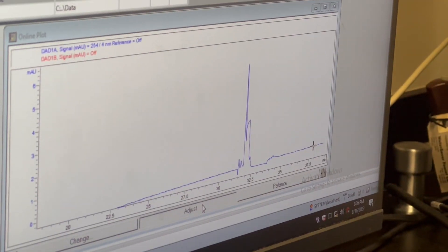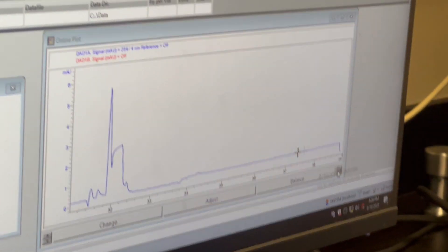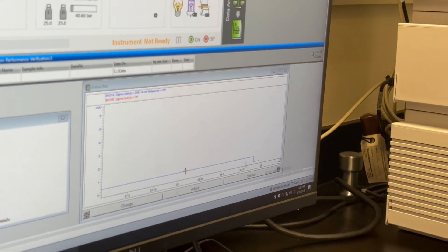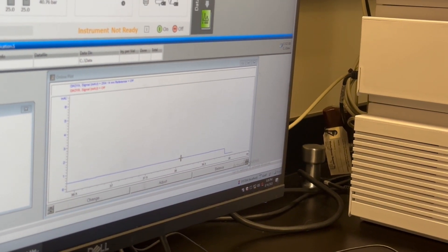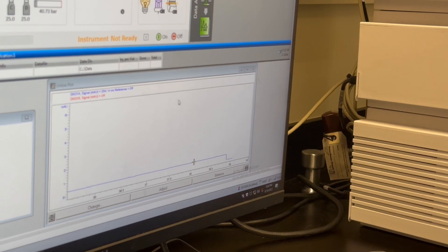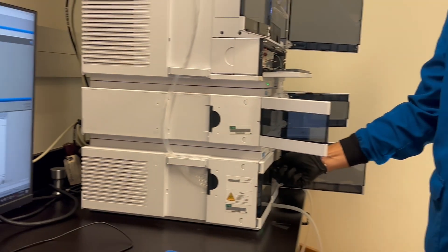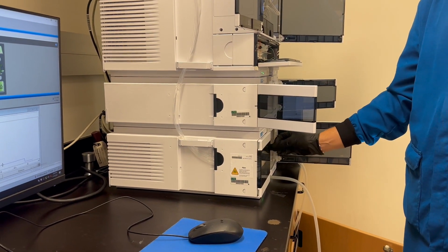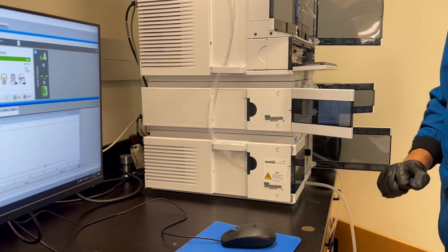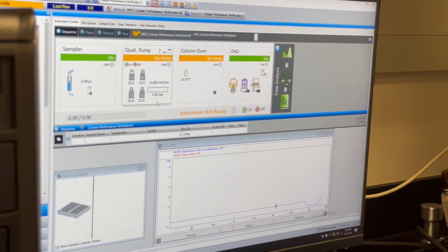So now we're good there. We can go back and zoom in to where we want to see — I like to have it at one minute or half minute intervals. From here, we're going to open the purge valve again just to make sure anything that might be in the line is purged. Purge valve is open, switch off the pump — no more flow is happening.